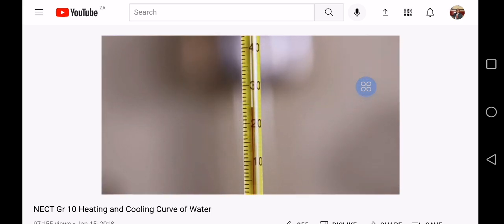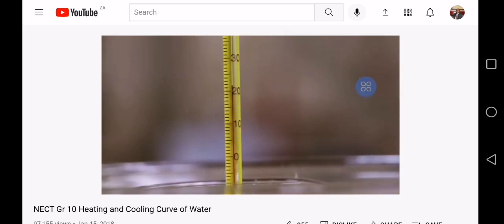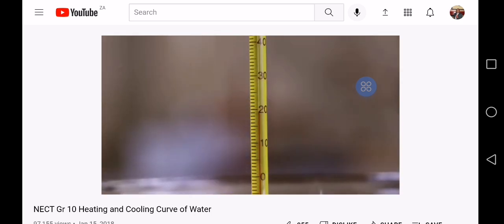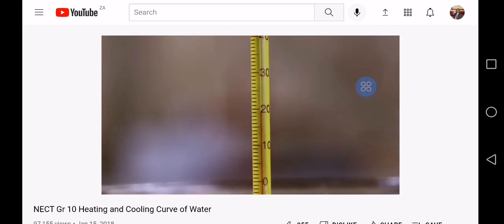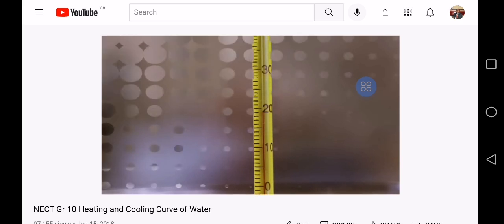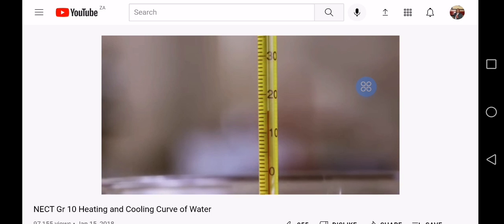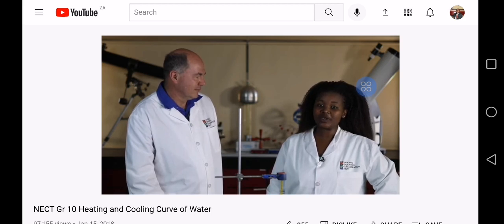3 minutes. 4 minutes. 5 minutes. 6 minutes. All done. If you missed a couple of values, you can ask for the video to be replayed and you can pause it at the individual values. However, don't take too long doing that. There's plenty more work for you before you complete this practical investigation.